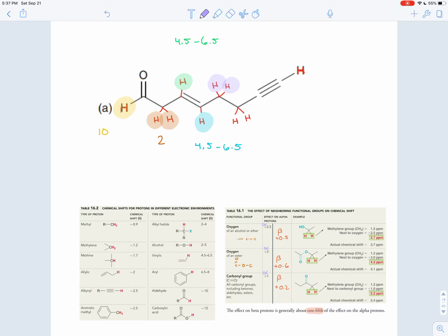Because those hydrogens are CH2, you might be tempted at first to think that the peak would appear at around 1.2, but don't forget the double bond. When you have a double bond, you have to be especially careful because those hydrogens can be allylic. The hydrogens are one atom away from an atom in a double bond. That makes them allylic, and that means that they feel that magnetic anisotropy like we discussed in a previous video, and so the absorption for them is shifted up a little bit. You'd think it would be around 2.